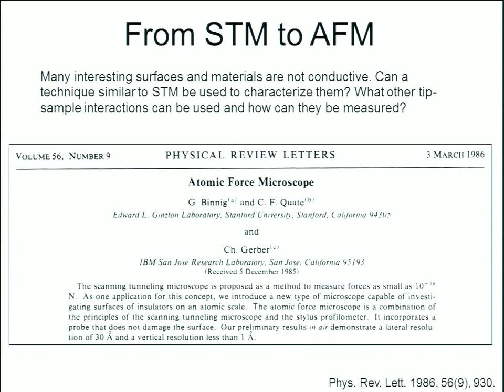So first of all, how did we get to an AFM from the advent of the STM? Well, the problem was there were a lot of materials we were interested in characterizing, but they were not conductive. So the goal was to come up with a technique similar to STM, but have it somehow be able to characterize non-conductive samples.